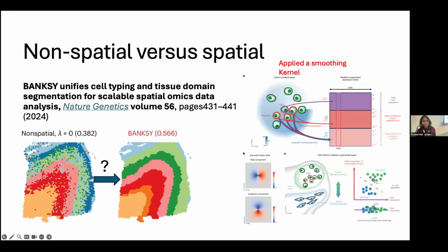So logically, when you do spatial clustering, what is it that you want, right? So you do want to take the gene expression of your cell, right? So every cell has got n number of features and they all have a certain expression level, right? But that is something that you do even in single cell, right? So that's the baseline. You need that. You cannot do without features. But the next additional layer is that you have an additional matrix that's going to give information about the distances between these cells, all right? How they're organized, whether they're close, whether they're far apart, or whether they're clustered together.